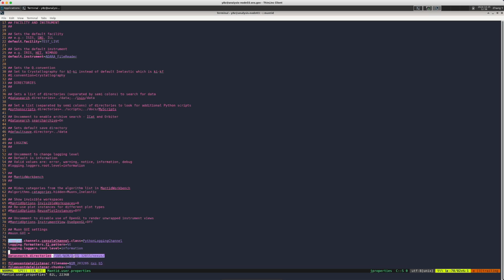For sure, we can put it in here, just using the editor in this way. Or later on, I can show in the GUI how we do the setting. But basically, we need to tell the program where to find this data.